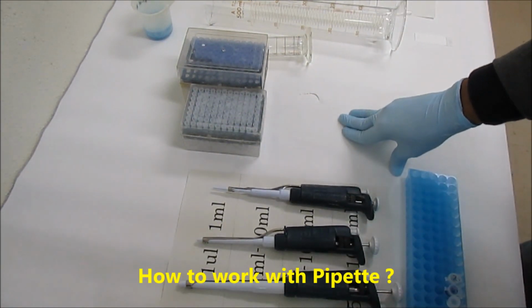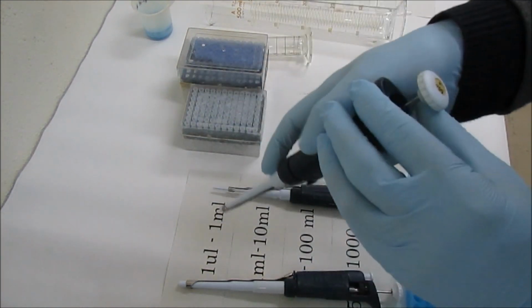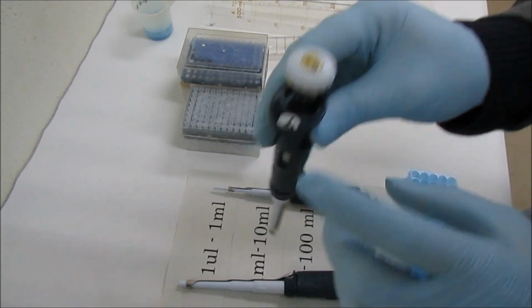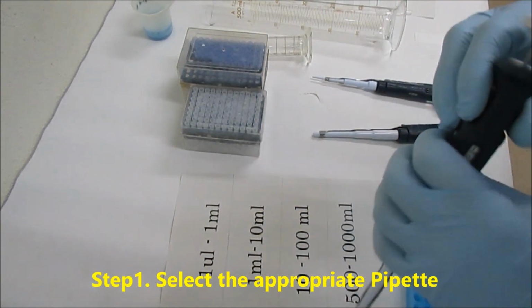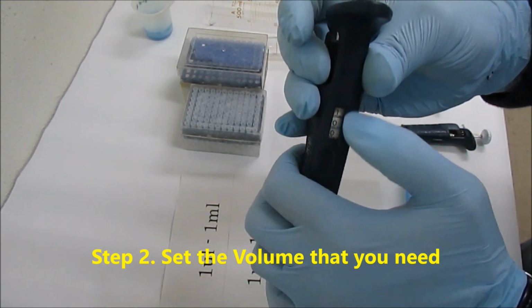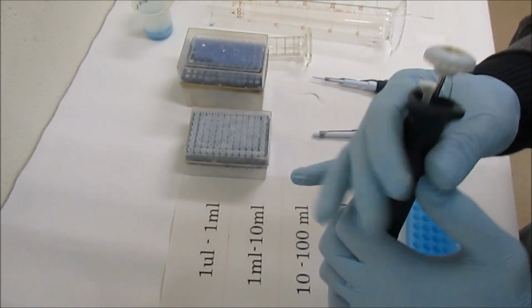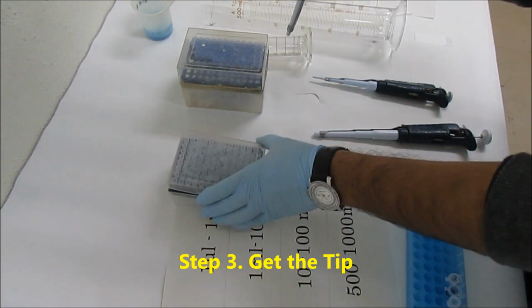So, how to work with a pipette. Suppose you want to measure 100 microliters. I know that 100 microliters falls between 2 and 200 microliters, so I can use this pipette. I select this pipette and set the volume. Later I am going to tell you how to read the pipette, so don't worry about it. Once I set the pipette, I have to get the tip.